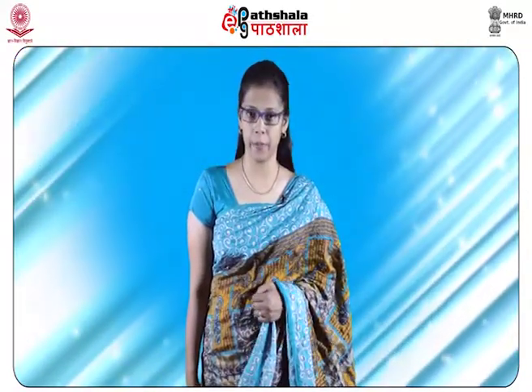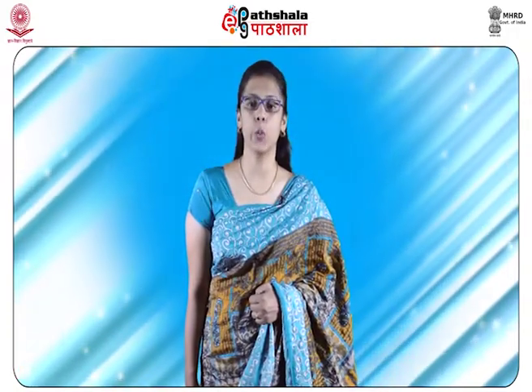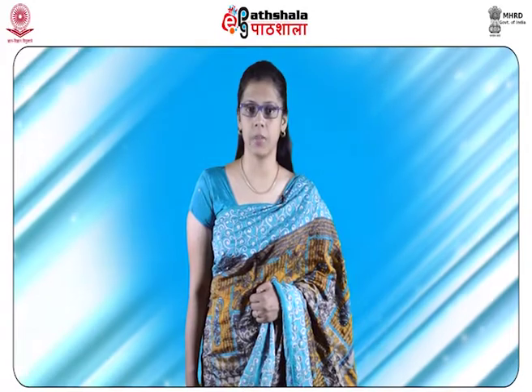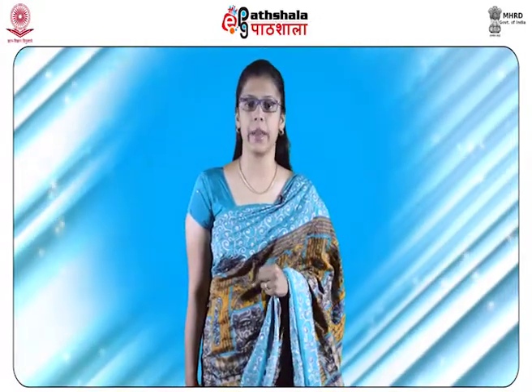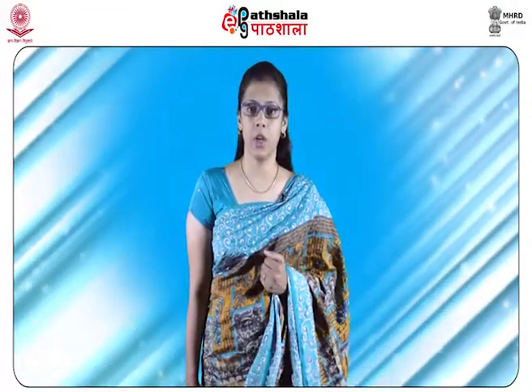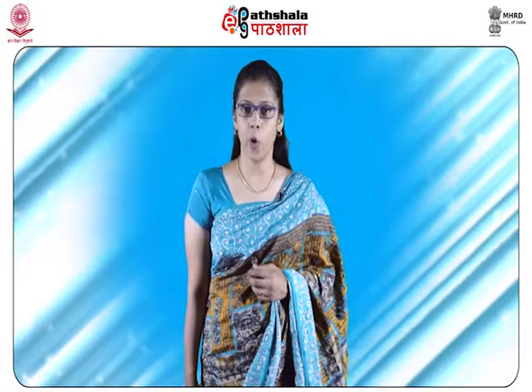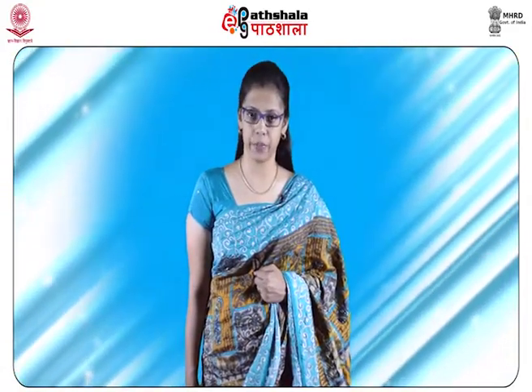Introduction. An important component of a fiber is its color. That can be an important clue for forensic scientists. Color present in fiber can be natural or imparted by use of dye. Chromatography is the approach available for forensic scientists. Chromatographic methods require the removal of the dye from the fiber followed by its examination.